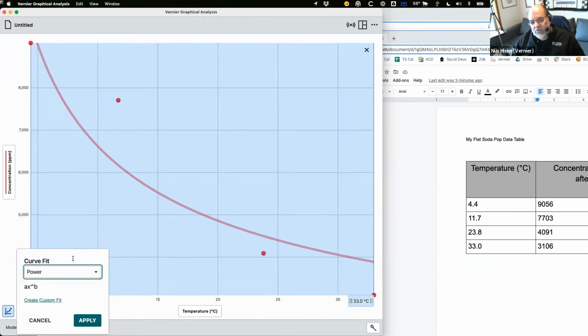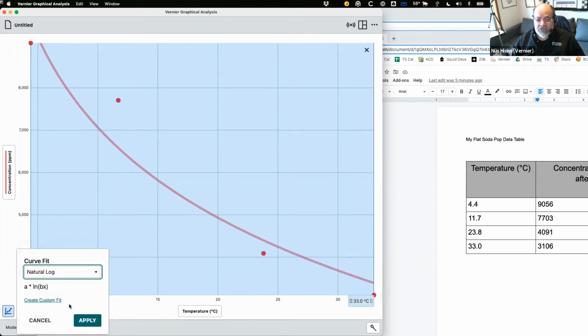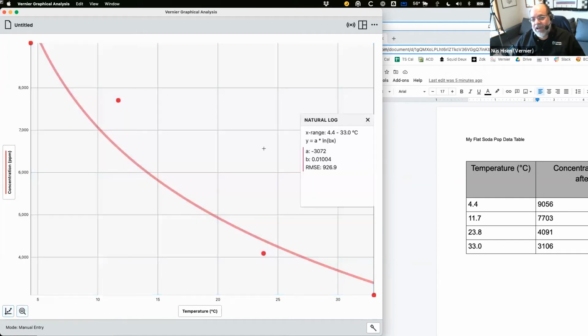Now, one thing you might want to take into account, and I didn't do that right now, is you might have your students actually do a little bit of extrapolating. And if you're going to do that, you probably want to be careful with your fit and your axes. So I don't care about this box at all. I'm not going to use the function. I'm just going to kind of slide it out of the way.